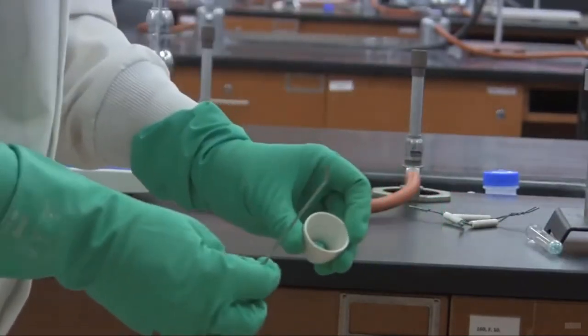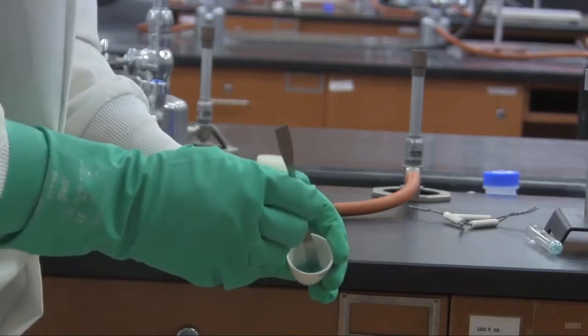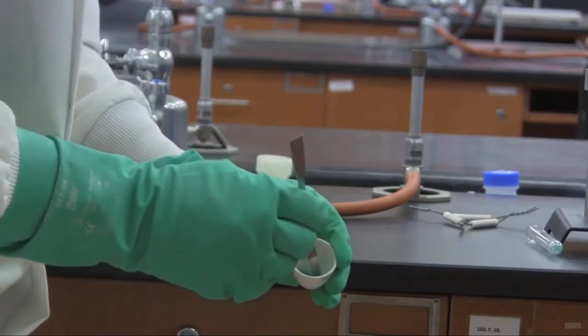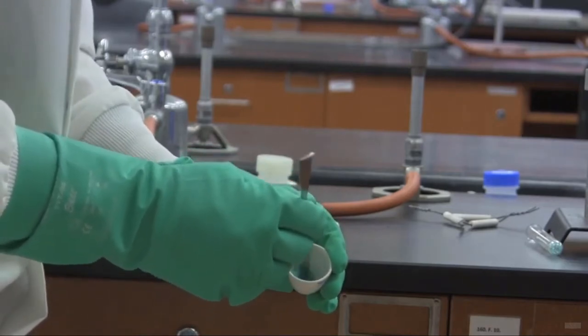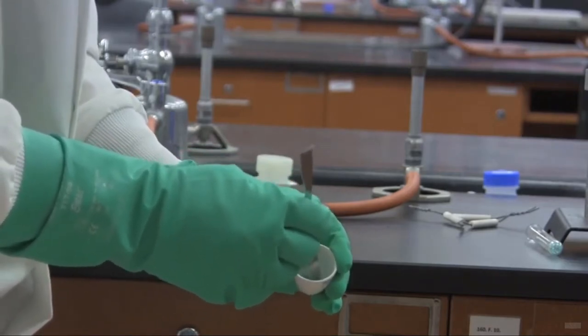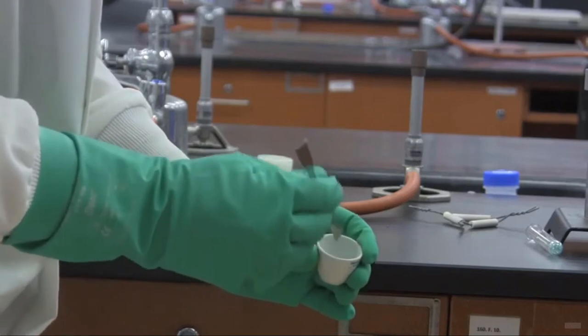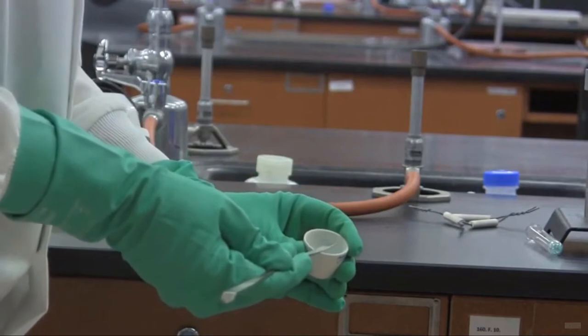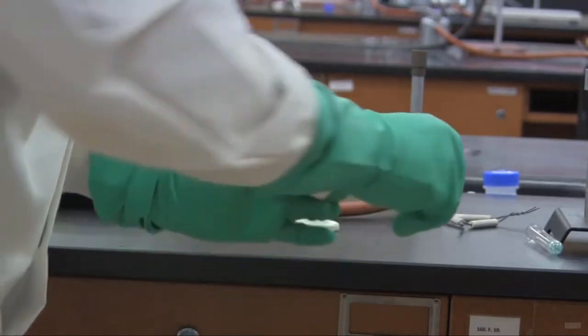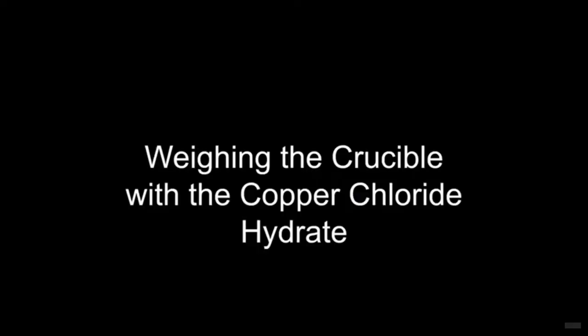Now, I want to show you what the sample looks like in the crucible. And you can see that it is a little lumpy. So what we're doing is just going in here with the spatula and just breaking apart any lumps that we might see here. This will help with the reaction and make sure that it all gets dehydrated once we start heating it. And again, don't worry about any that might be left on the spatula. The reason we're not worried about that is, again, we haven't weighed it yet.